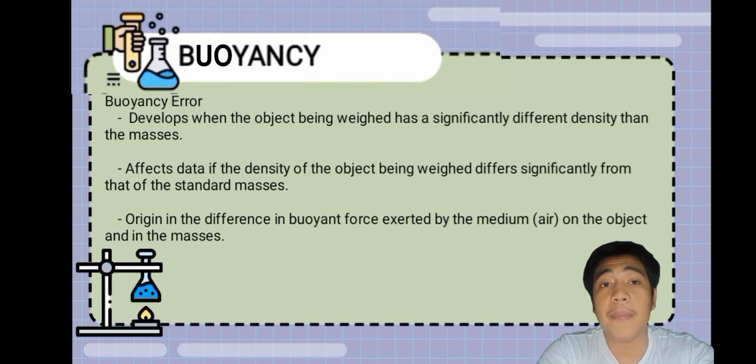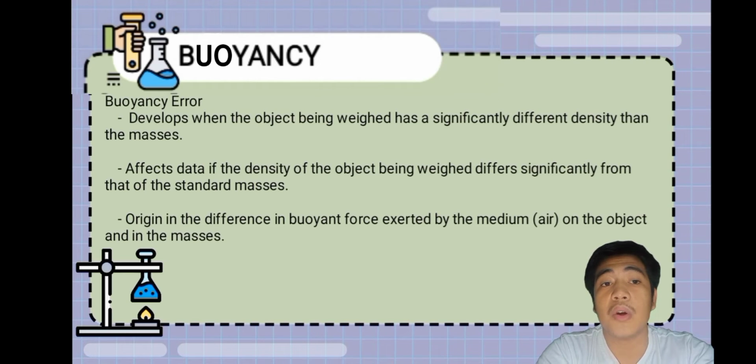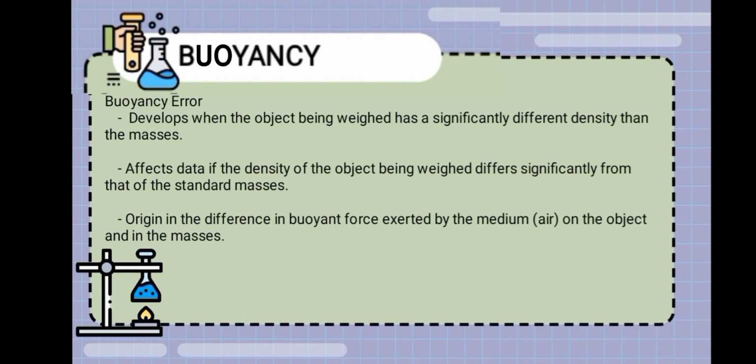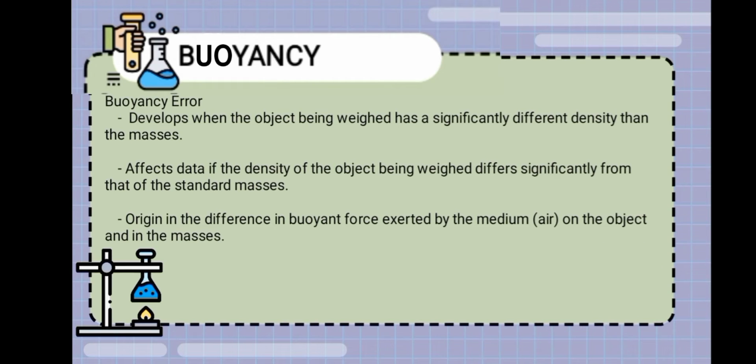This error happens when there is a difference in the buoyant force exerted by the medium, which is air, on the object and on the mass.